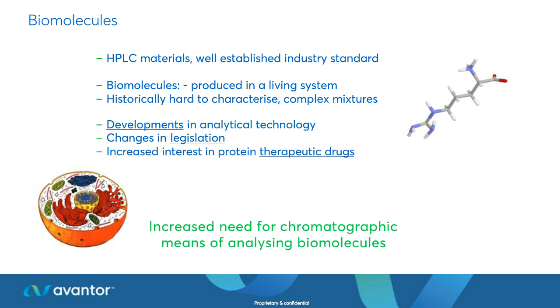So in order to use these pharmaceutical APIs, the purified compound must be available, and a method for analysing it and accurate quantification is necessary. So there's ICH development guidelines, Q2A, Q2B guidelines that look at the safety and the efficacy, and then we can demonstrate that to the regulatory bodies. So we need to make sure that we're proving product purity, we're monitoring production to make these biotherapeutics useful and safe for everyone.